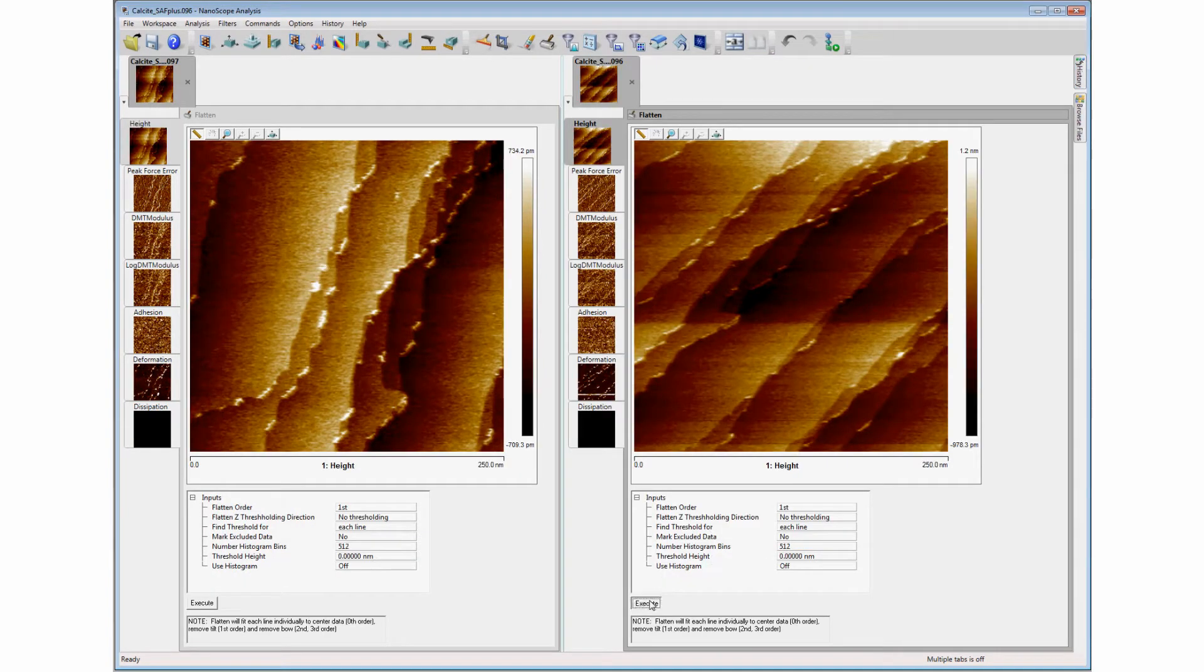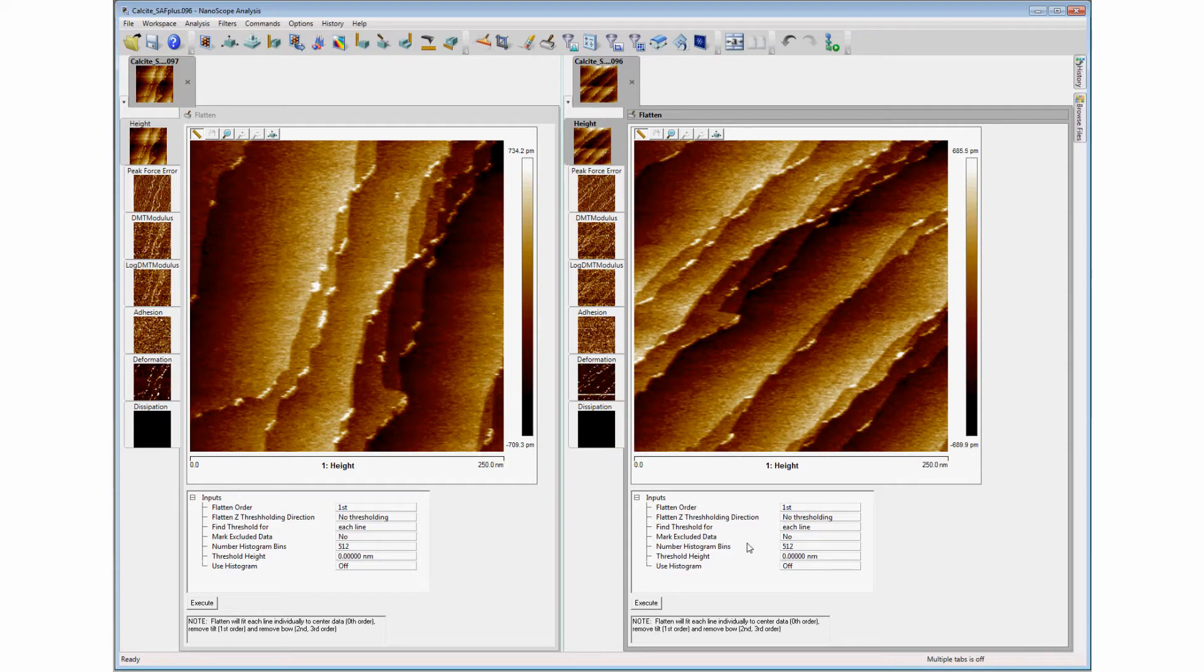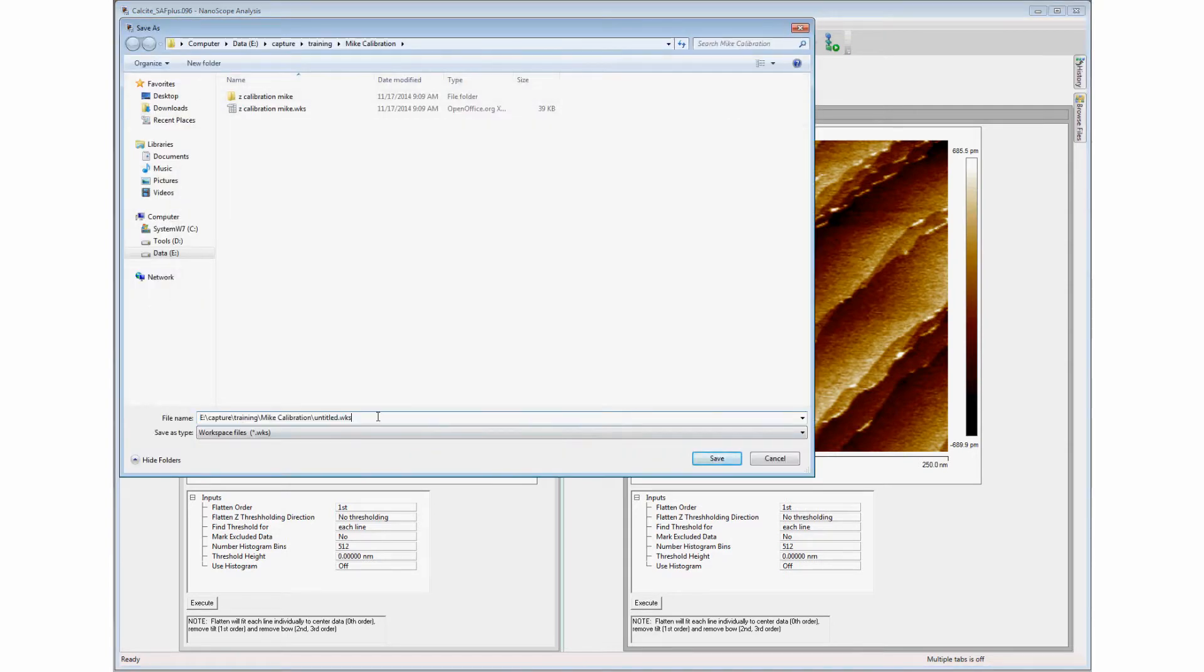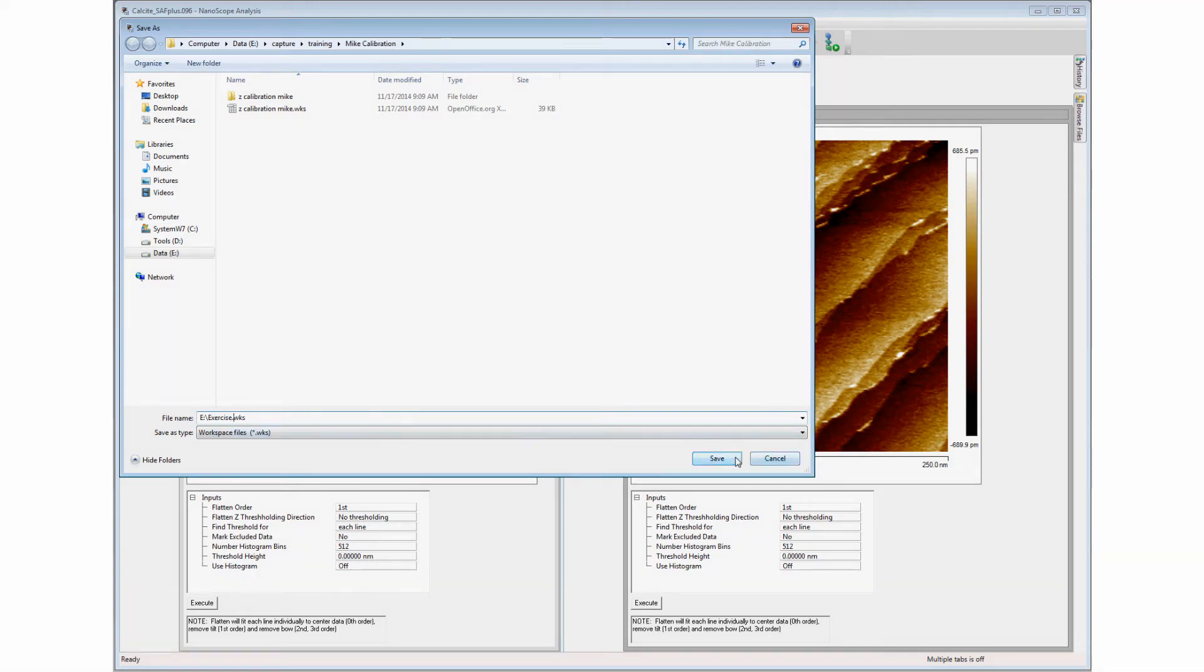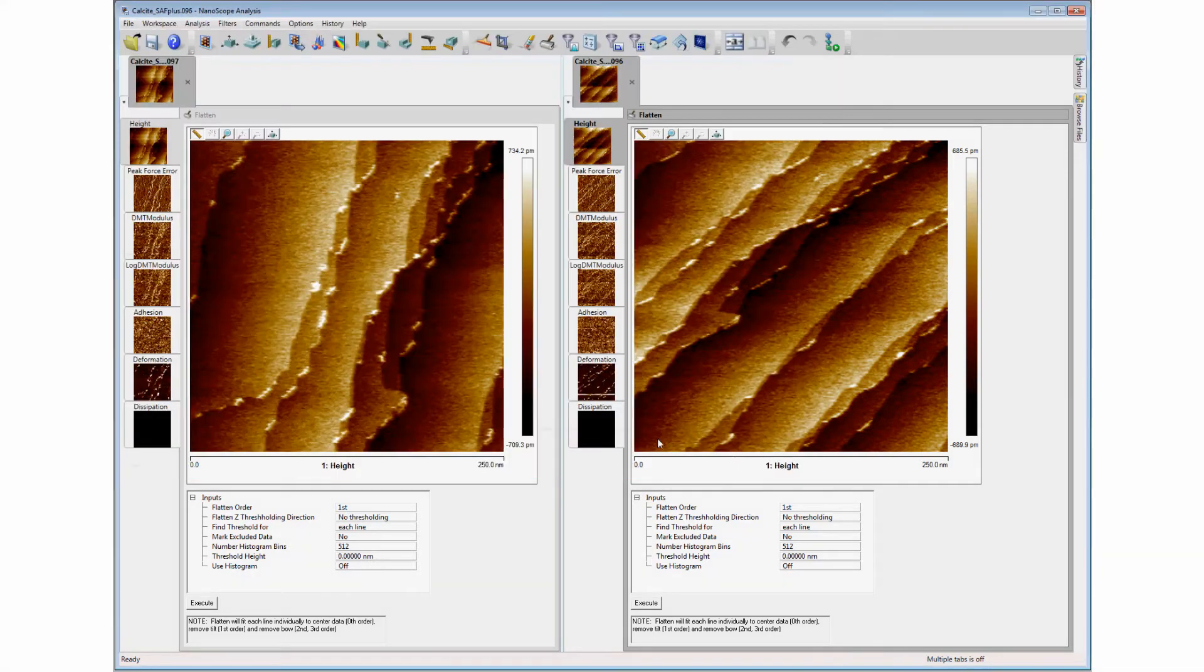Once operations have taken place, the user may save the displayed images and the processing steps for later use by selecting the Save Workspace command and naming the workspace file. Recalling the file restores the work area and the history of all the processing steps previously taken.